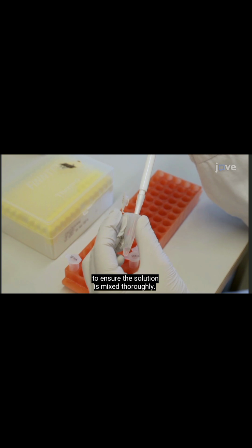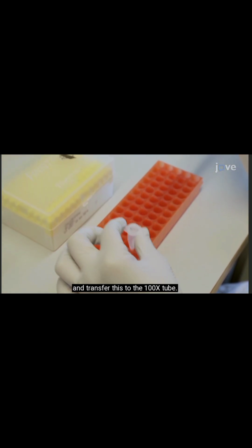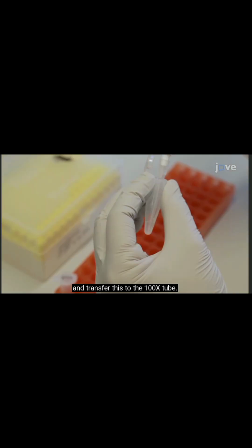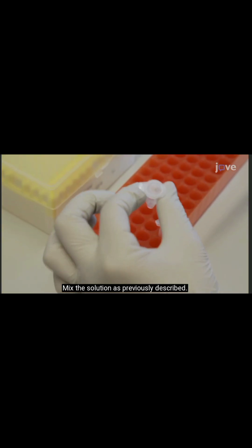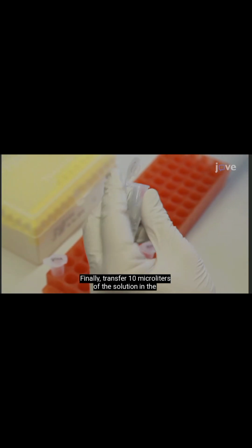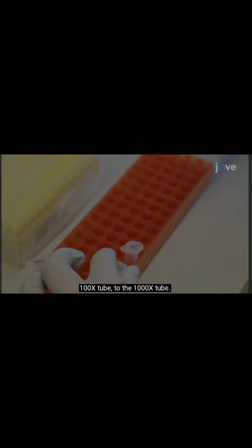Then remove 10 microliters of the solution from the 10x tube and transfer this to the 100x tube. Mix the solution as previously described. Finally, transfer 10 microliters of the solution in the 100x tube to the 1000x tube.